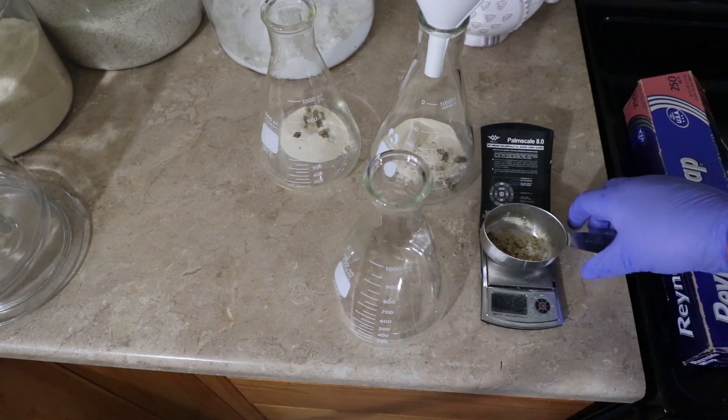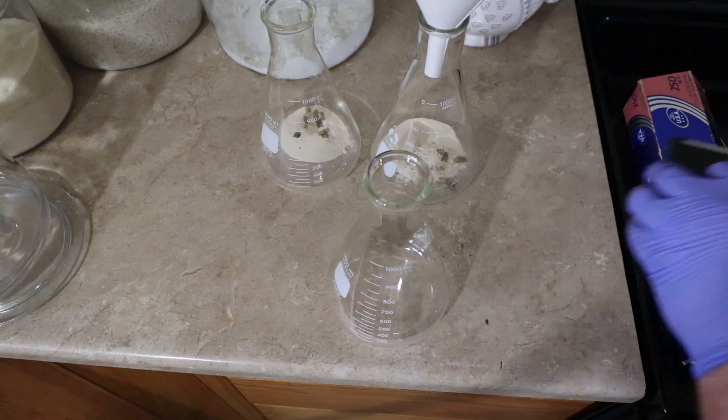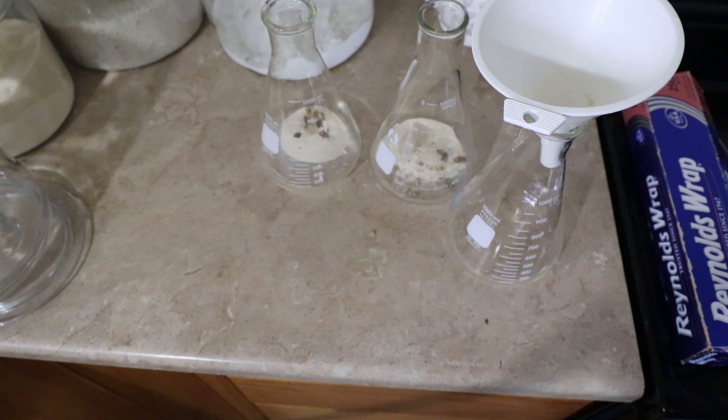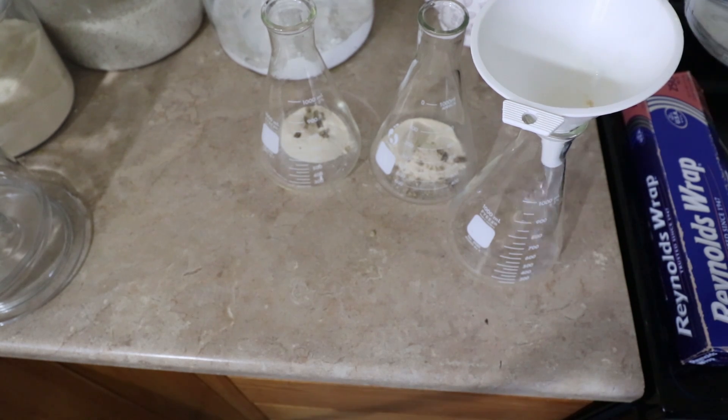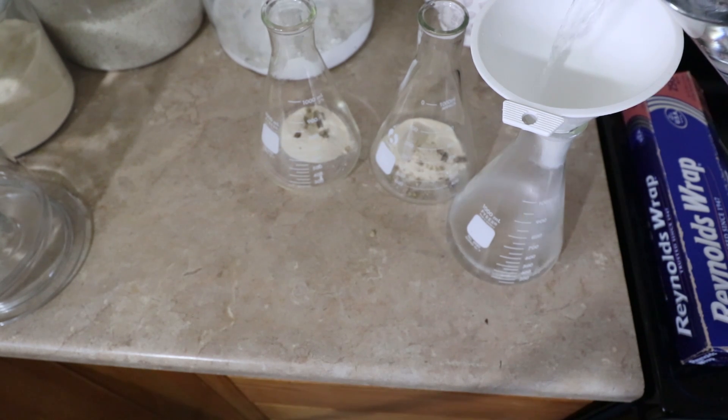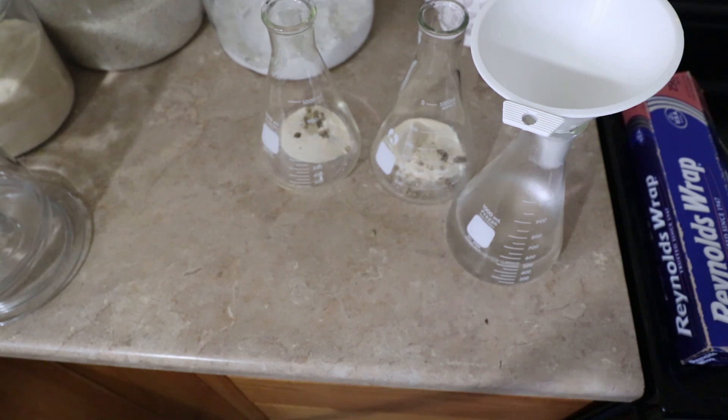Alright, so now I need to get water. Let's move all this out of the way, and I'm just going to pour this until it comes up to the 500 milliliter mark. And I'm going to make a big mess apparently when I do it — you guys make me nervous, it's like having your boss watch you over your shoulder.